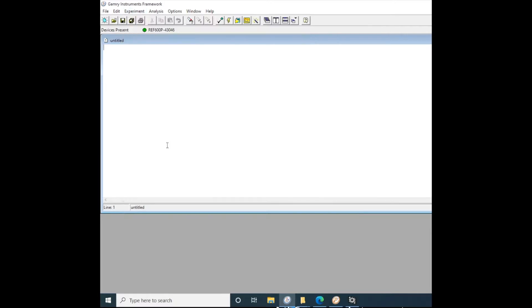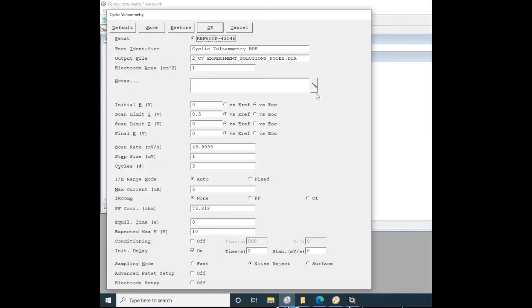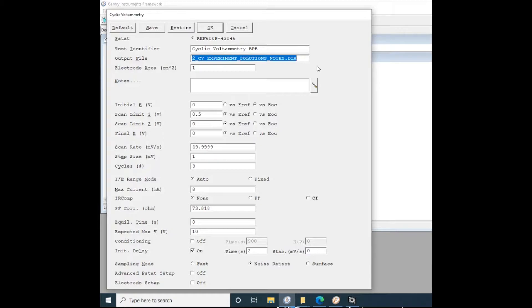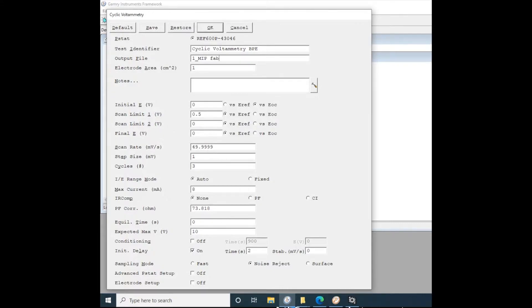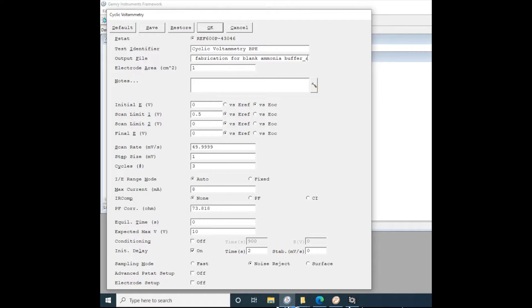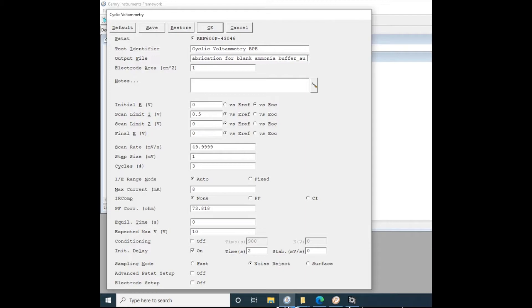To do voltammetry, you're going to go to the physical electrochemistry menu. Set your file name. We like to do one underscore or the number of the experiment followed by an underscore, then some sort of identifier for the experiment. Today we're doing blank ammonia buffer solution on our molecular imprint polymer electrode. And then another underscore with any notes afterwards. Maybe specify the kind of working electrode you're using or any sort of parameters that you've altered.